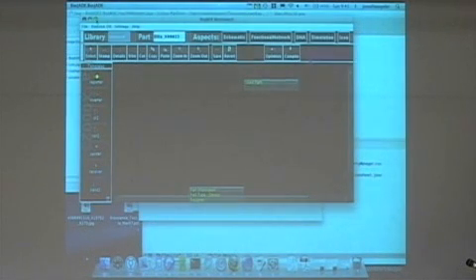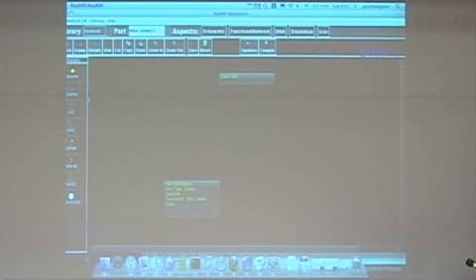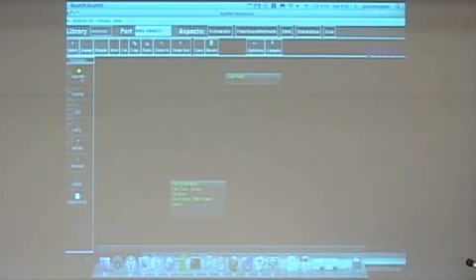So right now you have a blank slate. On the left-hand side, you have the ability to select various types of parts. So we have reporters, inverters, OR gates, NOR gates, sender and receiver cells, or sender and receiver parts, NAND gates, and pop source. So let's build a relatively simple system.